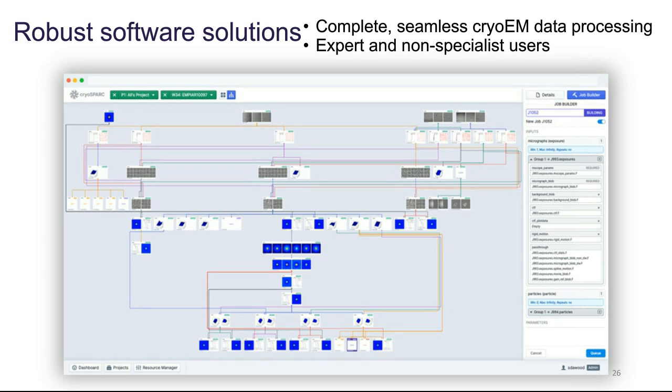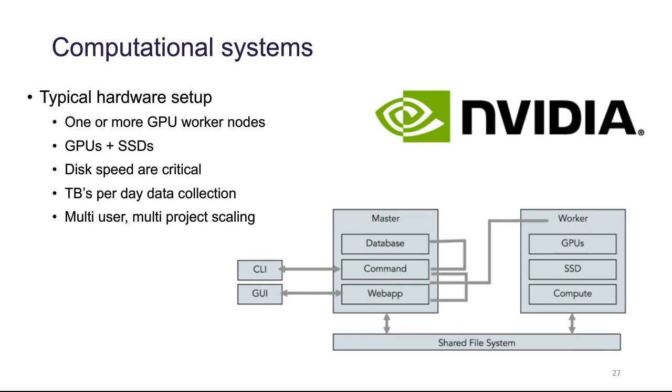Along with software, hardware systems need to be designed to handle the specific requirements of CryoEM data processing, especially to achieve scalability. Several CryoEM programs, including CryoSpark, are GPU accelerated exclusively using NVIDIA GPUs. The raw parallel processing power of a GPU is far better per dollar or per watt than CPUs, and CryoEM algorithms nearly all have highly parallelizable core computations, which generally benefit greatly from GPU acceleration. It's also worth noting that usually the algorithms scale well with multiple GPUs available in a node.